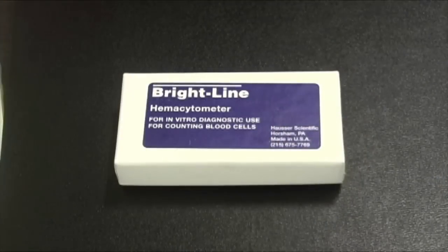Microscopes have many uses. One of them is for counting things that are too small to be seen with the unaided eye. In this video, we'll look at the hemocytometer, a device that's used to count particles and microbes and larger cells under the microscope.